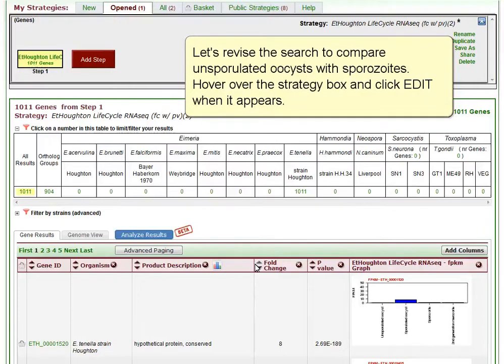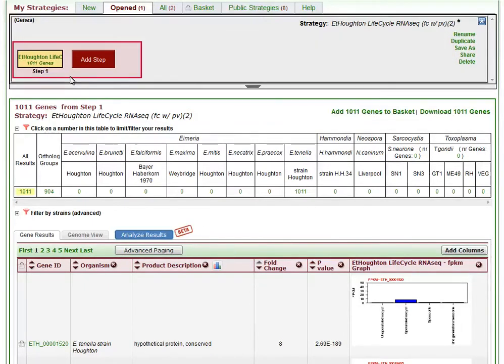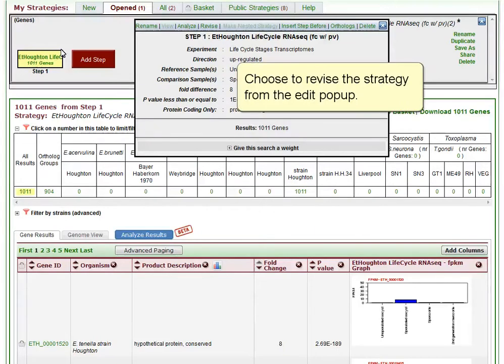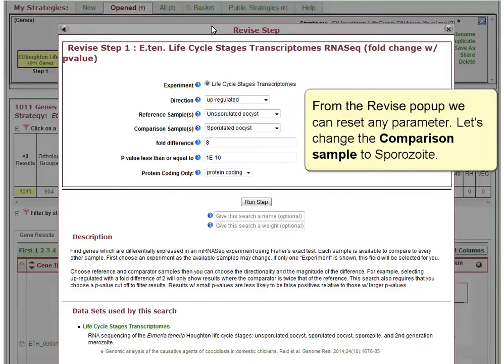Let's revise the search to compare unsporulated oocysts with sporozoites. Hover over the strategy box and click Edit when it appears. Choose to revise the strategy from the Edit popup. From the Revise popup, we can reset any parameter.